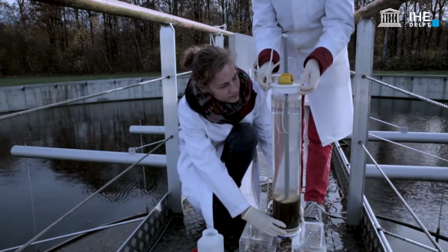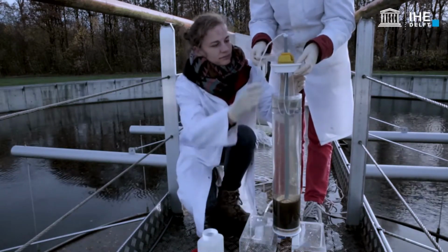The supernatant is sampled for TSS analysis with a syringe.